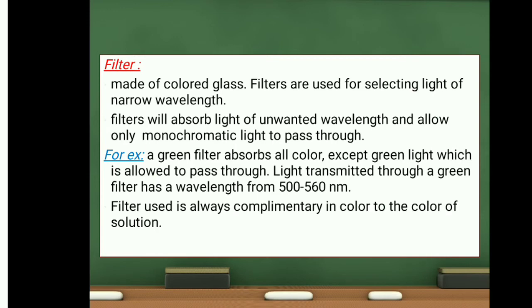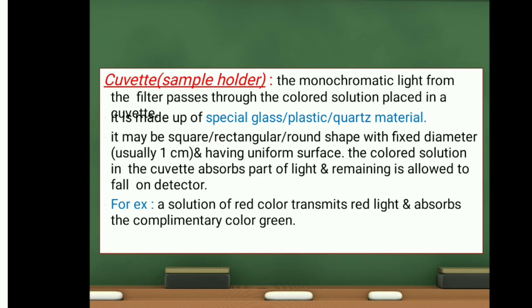Filter use is always complementary in colors to the color of the solution. Cuvette, that is a sample holder. The monochromatic light from the filter passes through the colored solution placed in a cuvette. It is made up of a special glass or a plastic or quartz material.